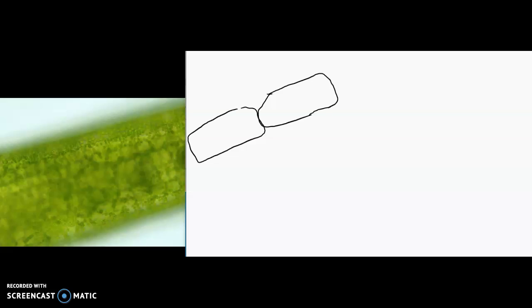And what we're seeing there inside each of these cells, so this would be the cell wall, are some little green objects and I bet you can guess what the green objects are.